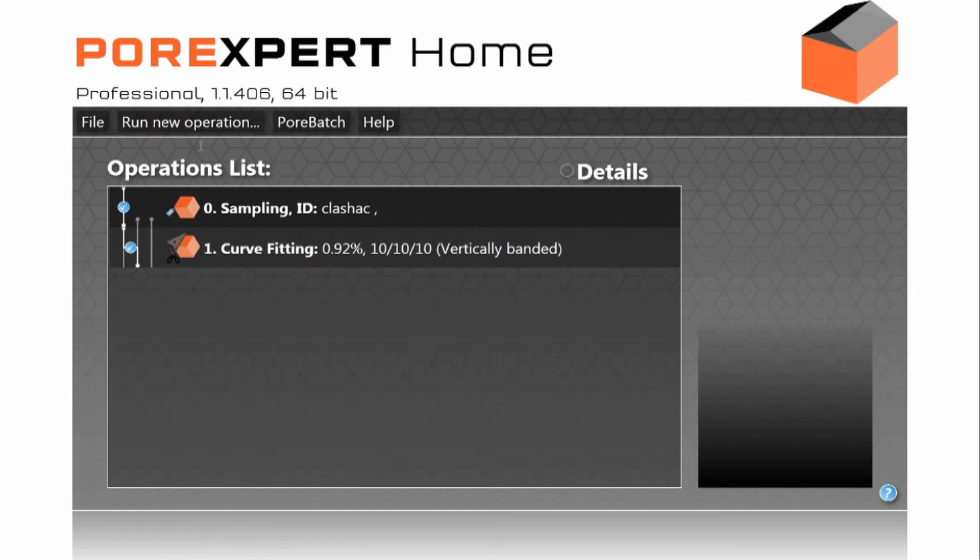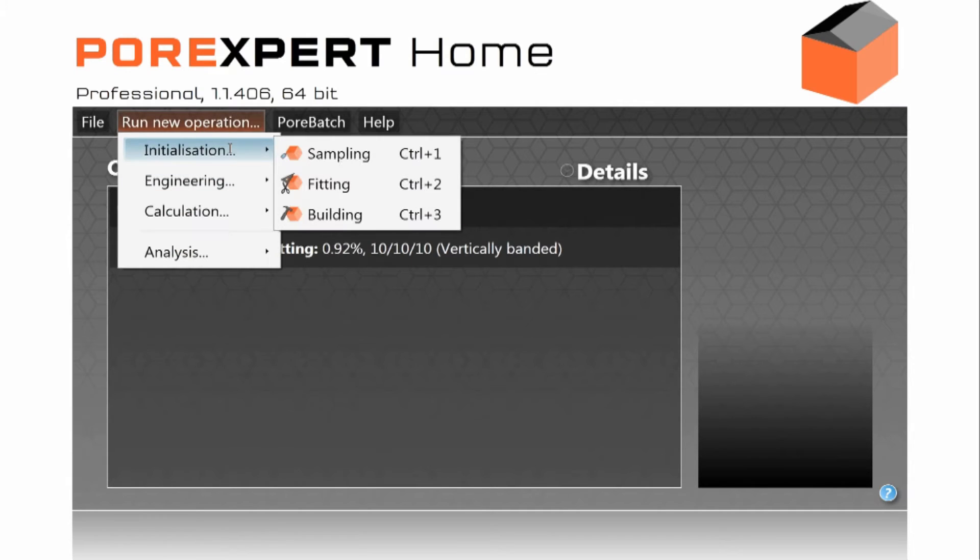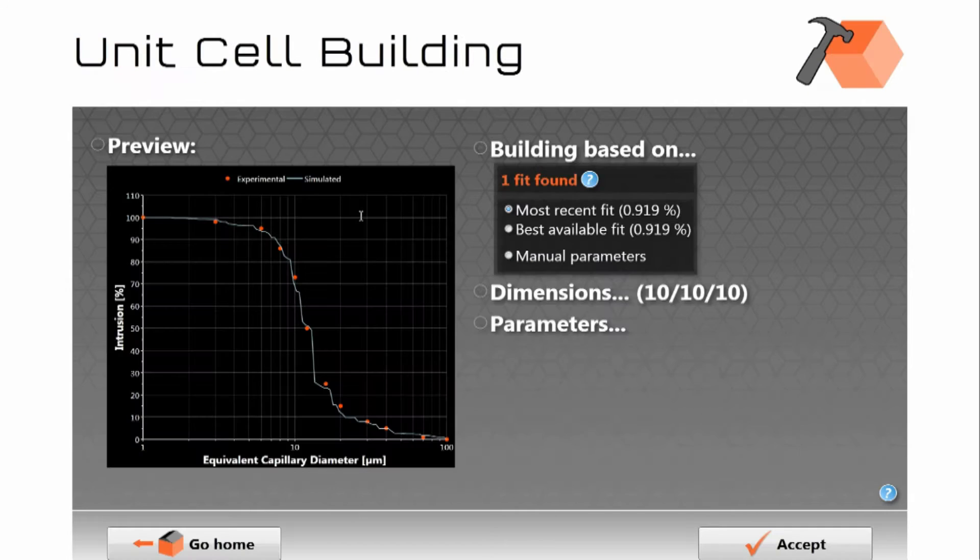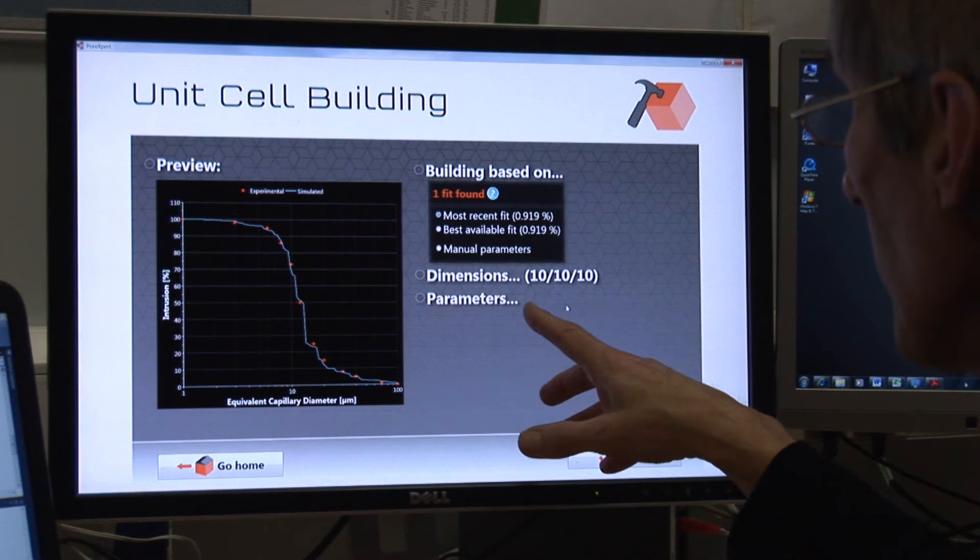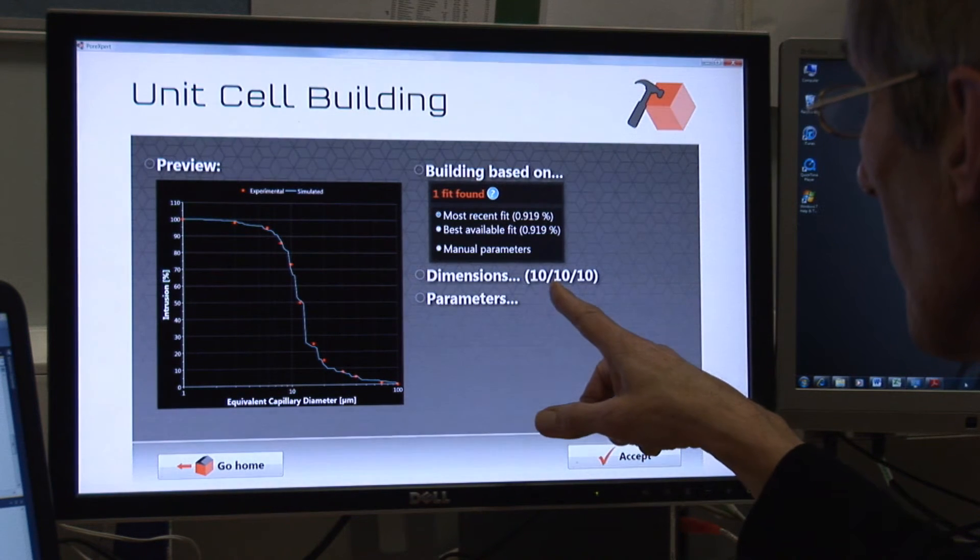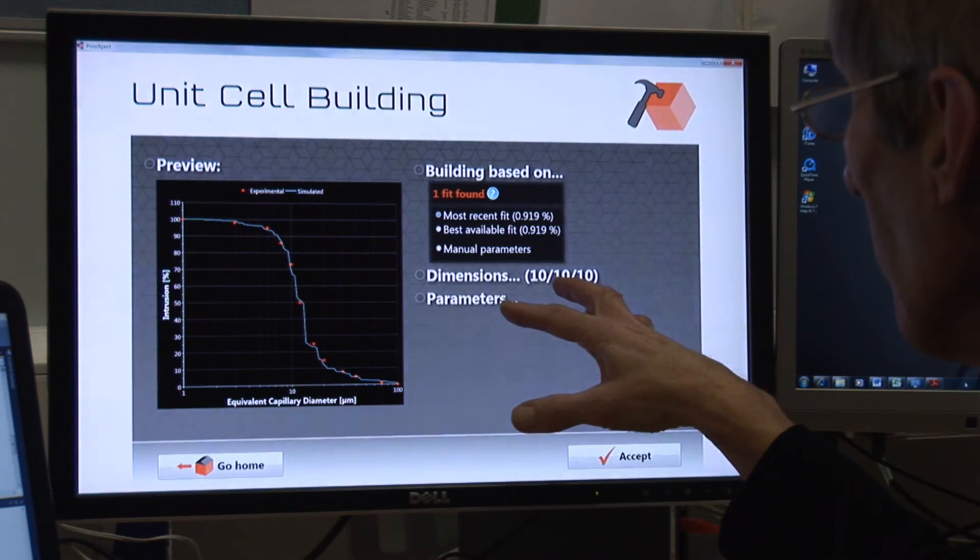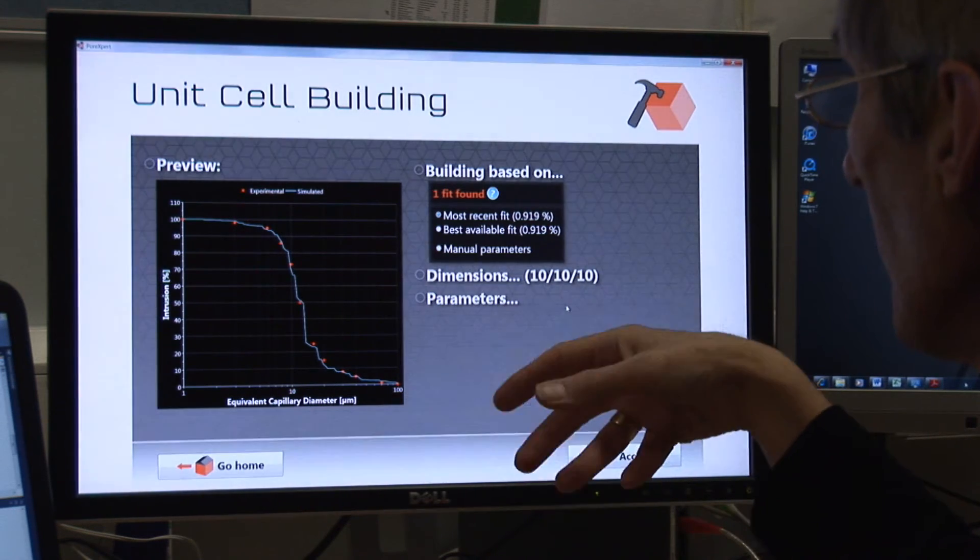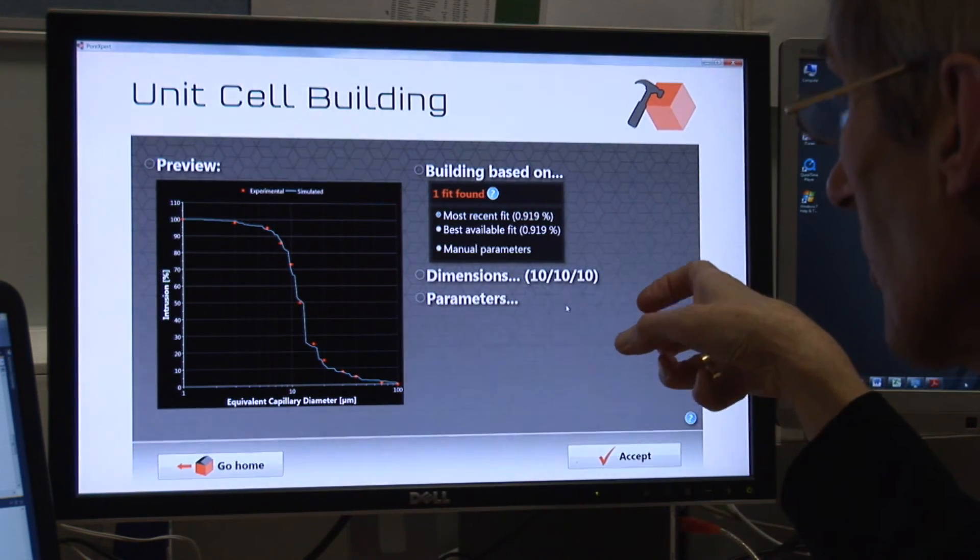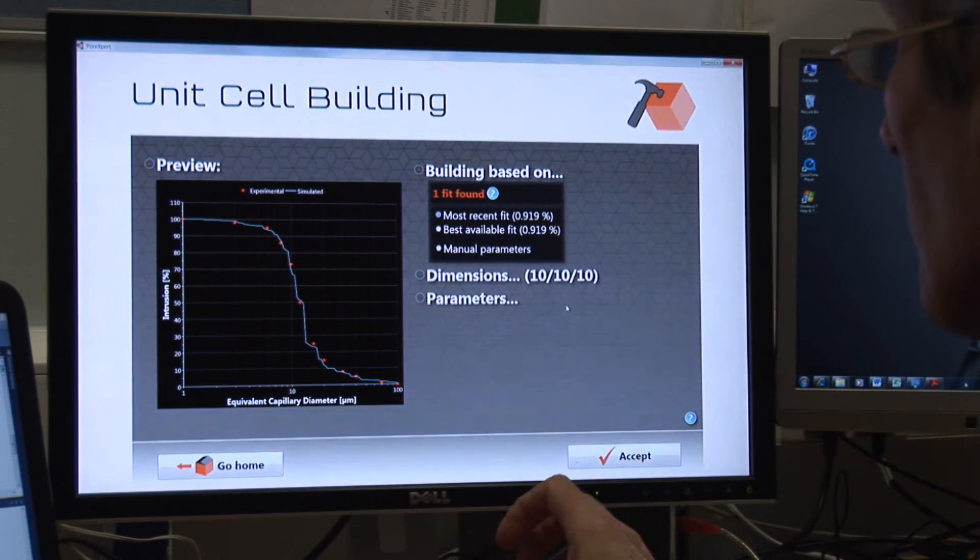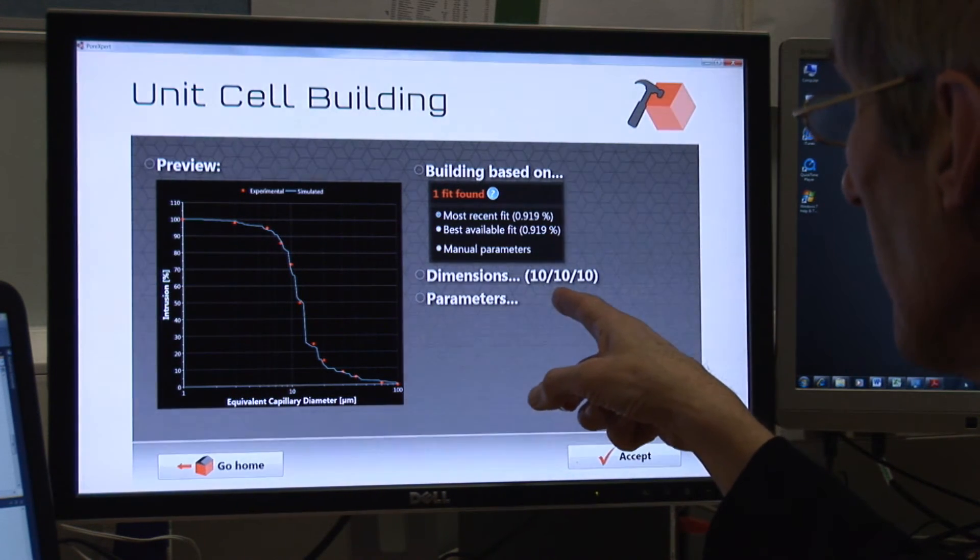So we then ask to do the next operation which is to build the unit cell. So we then build it. We are asking to do a unit cell of dimensions 10 by 10 by 10 pores with up to 3,000 throats connected to it. You can do much larger sizes than that.